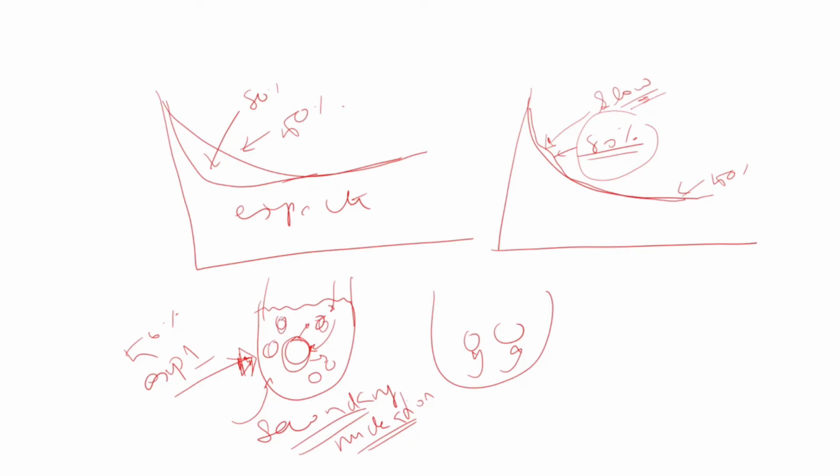So if you have some unwanted impurities, then it could trigger something called secondary nucleation, which can give rise to more crystals. Once we encountered secondary nucleation, the number of crystals inside the crystallizer will become higher, will increase.